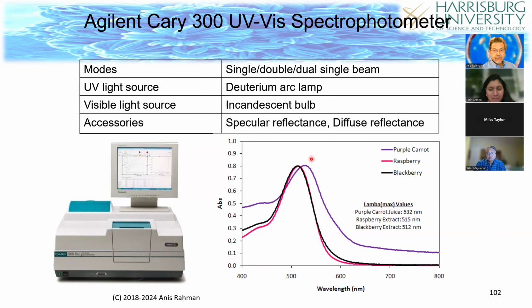So you expect to see a lot of absorbance peaks, except the sensitivity is a combination, not only the radiation, but also the instrument. If the sensitivities are there and the instrument is not able to record that, then we're not going to see it.